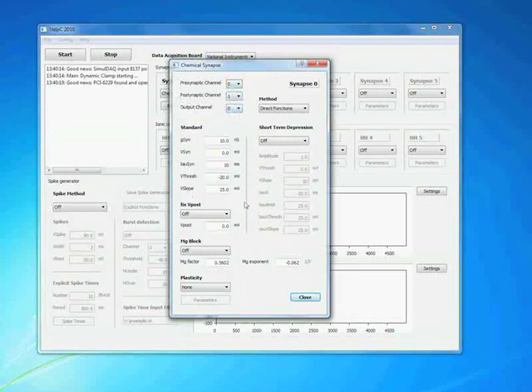Then we have parameters here, and I'll leave the standard parameters in. This is a 10 nanosiemens synapse with reversal potential of 0 millivolts, so it's excitatory. We have a time scale of 10 milliseconds and an activation threshold at minus 20 millivolts of the presynaptic cell, and the slope of activation of 25 millivolts.